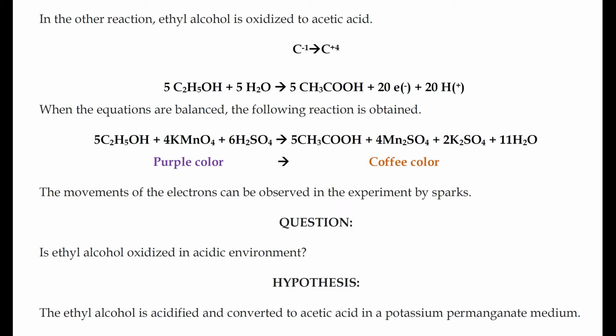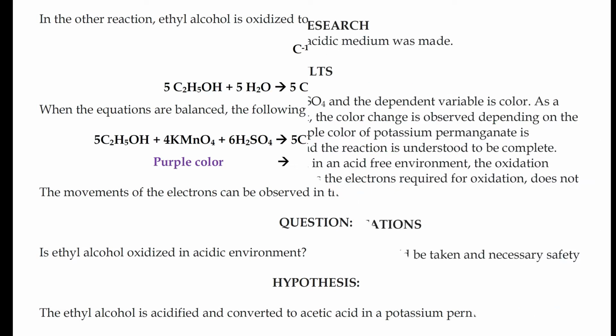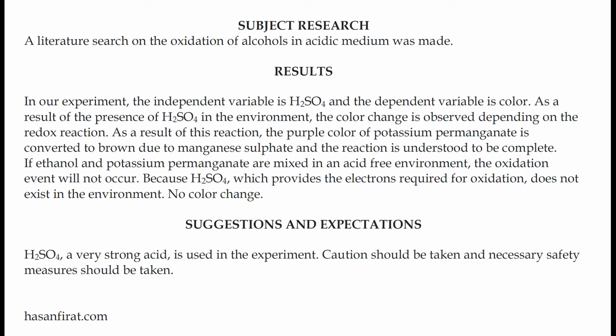Question: is ethyl alcohol oxidized in an acidic environment? Hypothesis: the ethyl alcohol is oxidized and converted to acetic acid in an acidic potassium permanganate medium. Subject: research. A literature search on the oxidation of alcohols in acidic medium was made.